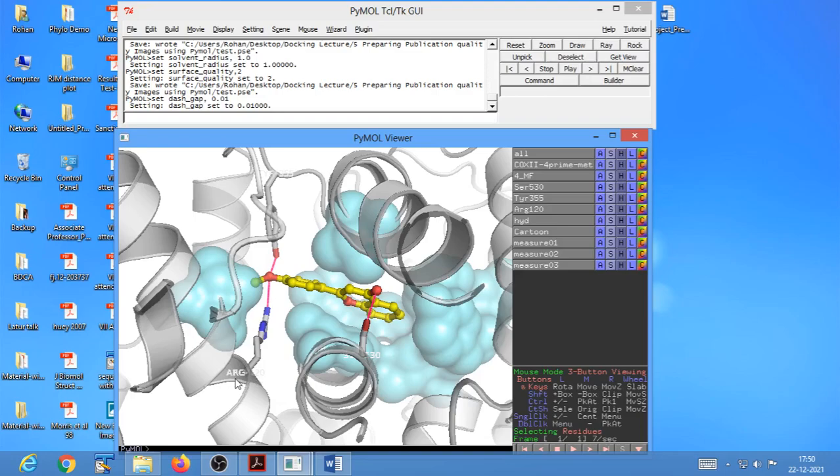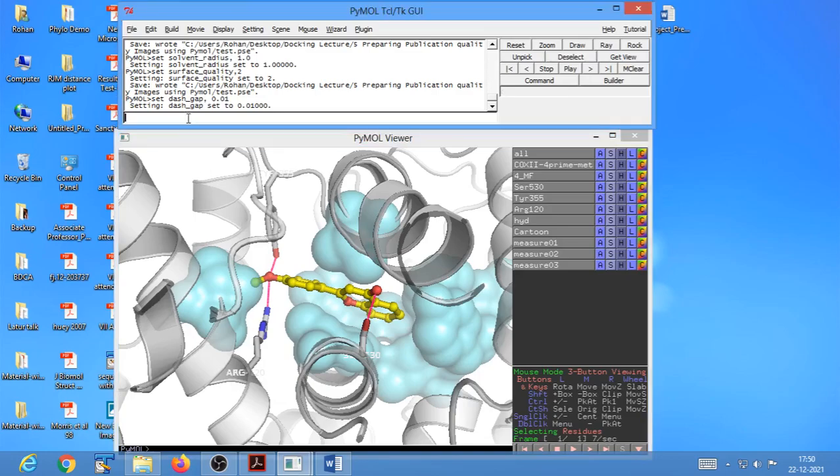What you can do is that we need to change the font of our labels now, and to change the font, we would be changing the font ID first. You can do this by using the set command. What do we need to set?